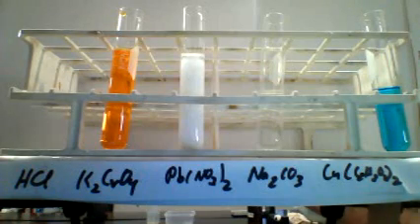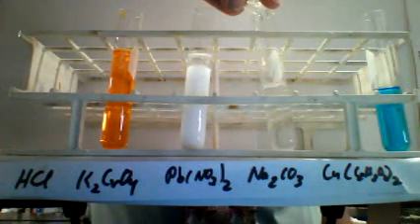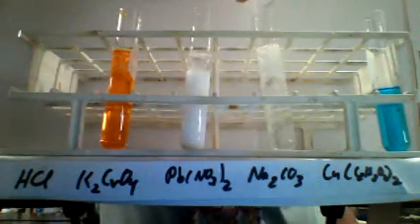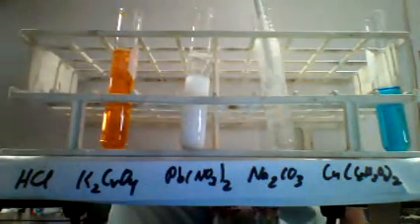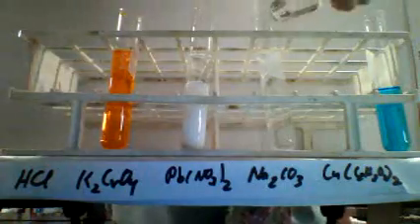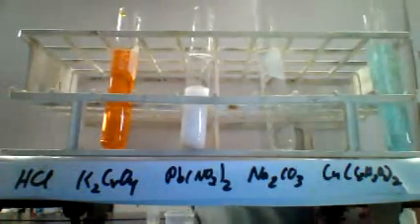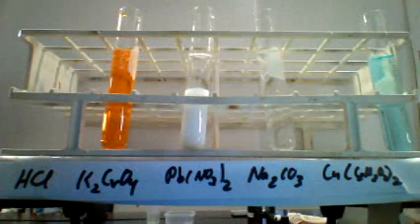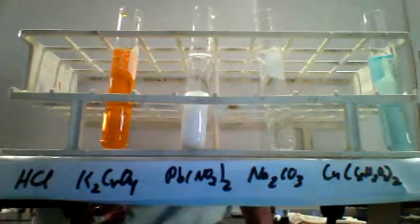Mix them together, observe the results. That finishes the first row on our data table.